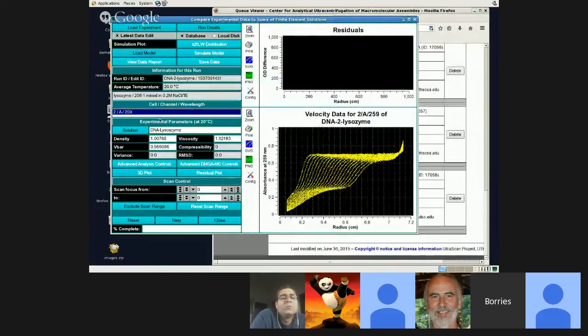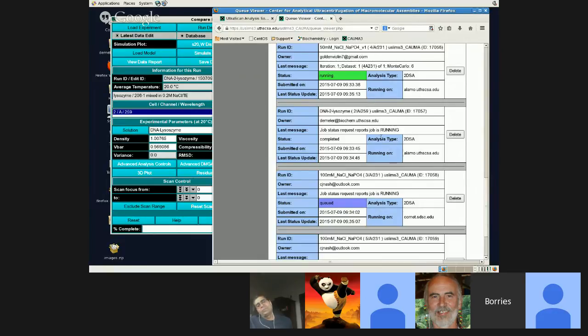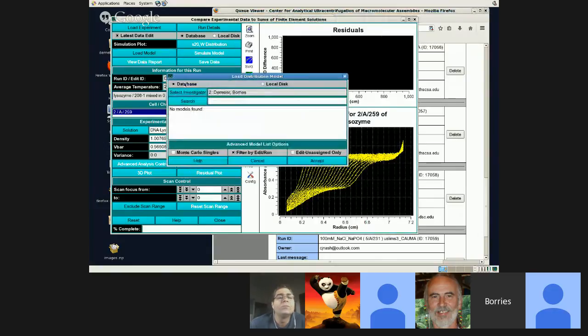We have all kinds of problems with the database today. What's going on? Well, we need to wait until it's actually disappeared from this list. If it's still listed in that list, that means it hasn't had a chance to upload it into the database. So we need to wait until this is cleared. This updates every 30 seconds, so we may have to wait another 30 seconds or a minute before this goes away. It's not there yet.